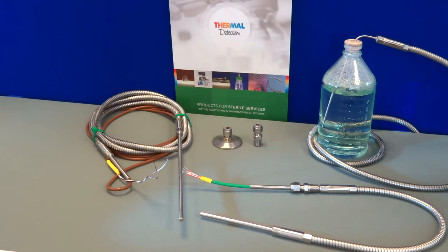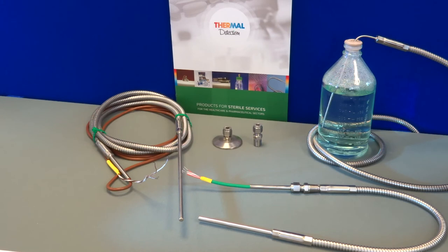All sensors manufactured by Thermal Detection are chemically etched with a discrete job number for traceability, and we can provide certification for all goods. Check out our form on the website, fill out your details, and we'll quote to your exact requirements by return.